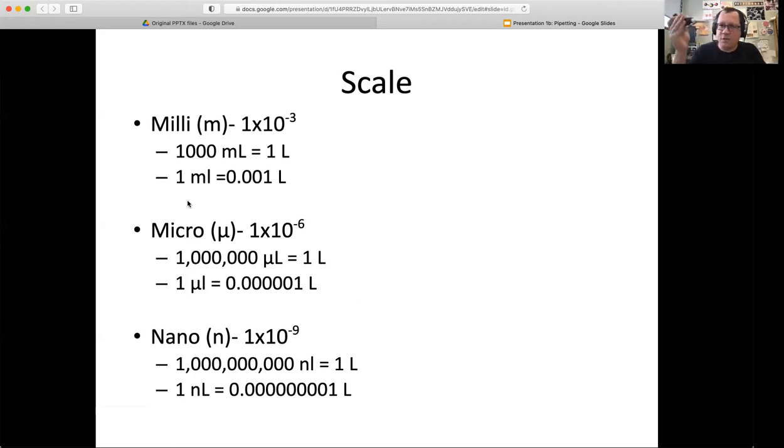So we can measure 1 microliter pretty reliably with a P20. And so you'll get the feel for what 1 microliter, what 1,000 microliters looks like. But it's useful to sort of have that visualized in your head. So when you're doing lab math and stuff, you can kind of say, okay, yeah, this makes sense. And like if you're measuring something out and it's a big volume that you're only going to fit into a small tube, there's probably some sort of a math problem going on there.